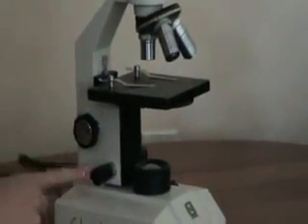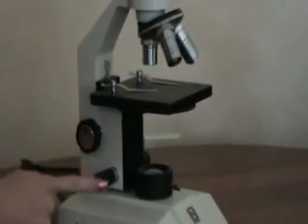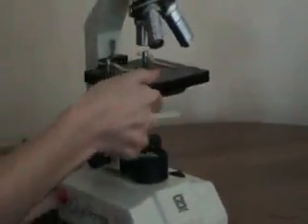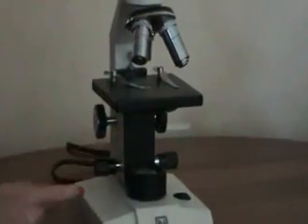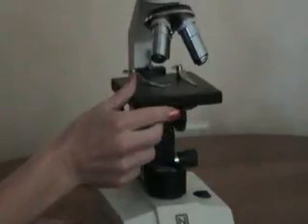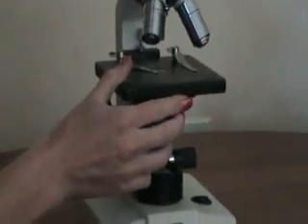Following down, we have the coarse adjustment, the fine adjustment, and the light source. The bottom part here is where you can adjust the light source. If I turn your microscope, you see this round piece — this is called the diaphragm. This controls how much light enters the microscope, allowing you to dim it or make it lighter, depending on what you're looking at.